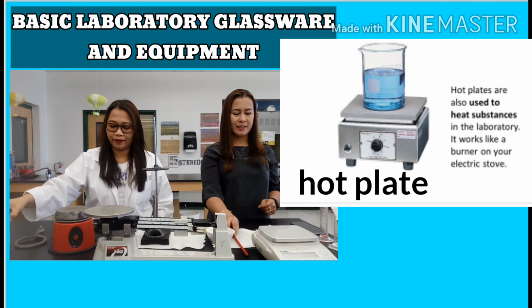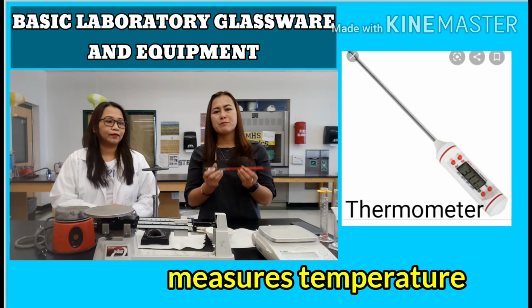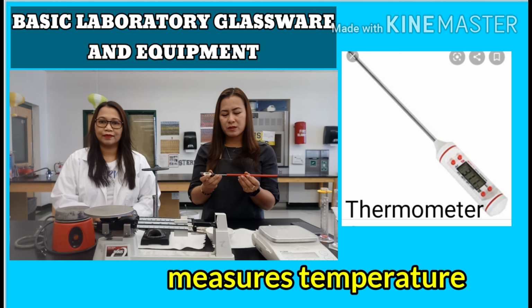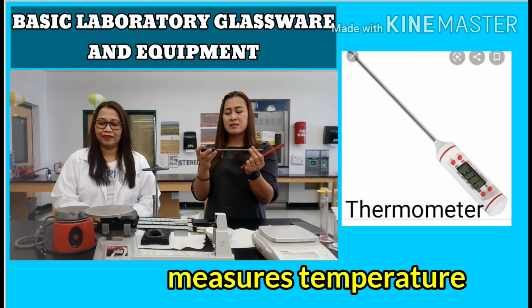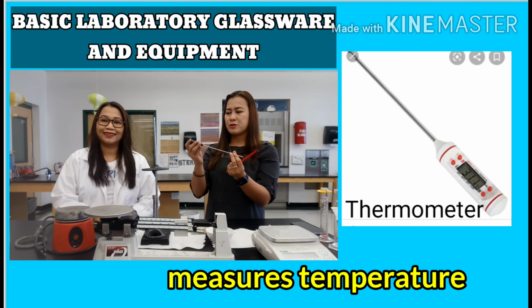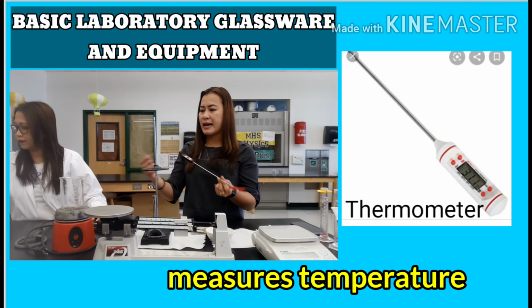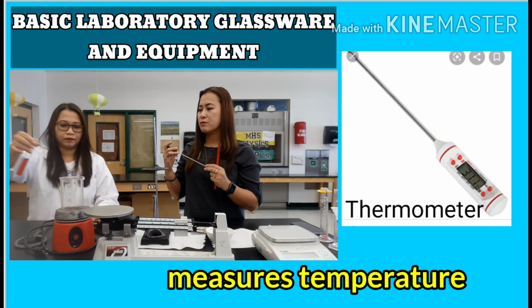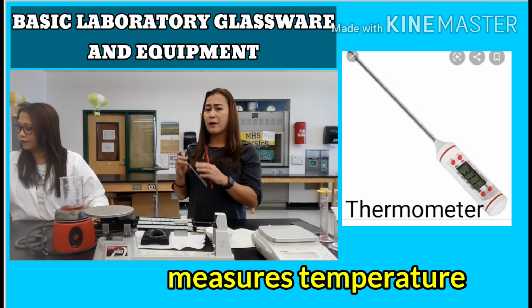All right. So if you want to find out the temperature or the degree of hotness and coldness of the body of an object, you may use your thermometer over here. This is your digital thermometer. So say for example, we have a sample on this side, and we want to find out how hot or how cold it is.